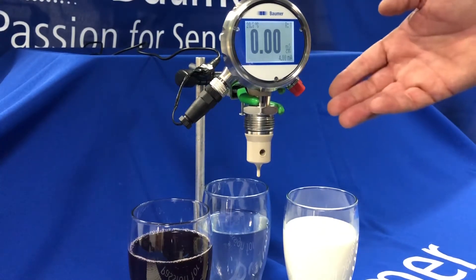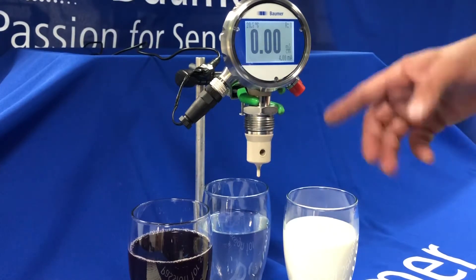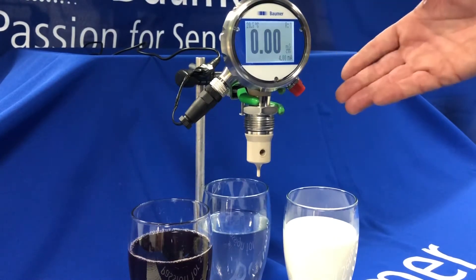I've got three different media to go through: some squash, some water, and some milk. We're going to show the phase separation and how it reacts on the screen to these three media.